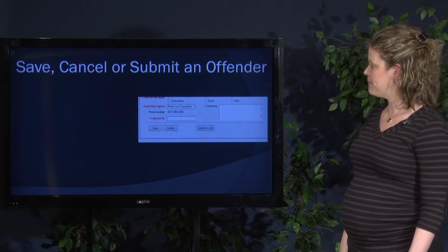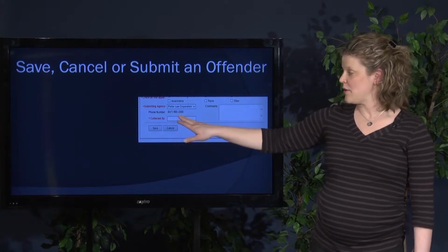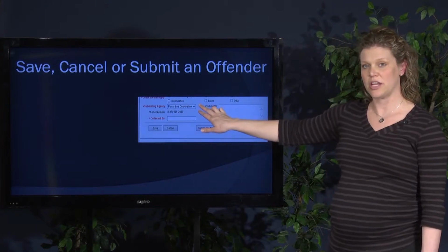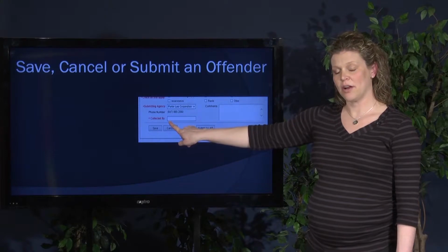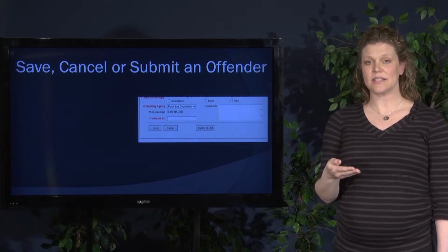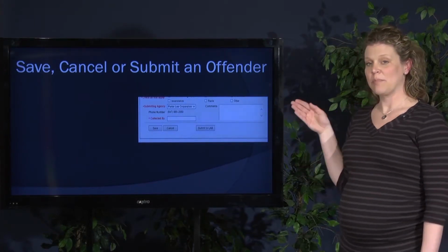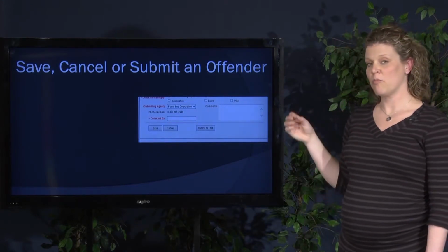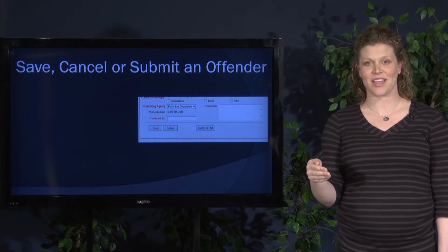All right, at the bottom, I should note the collected by is a required field. Now it's empty. These items here in submitting agency should be populated upon your entry into the website using your username. The collected by is not, however. If you've got a jailer or an individual that does not necessarily do the entry into this website, that individual can be entered here as the collector. You as the enterer want to make sure that you've got that name in there. Otherwise, we're going to contact you if we've got any trouble with that kit.